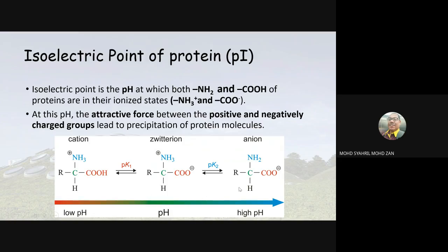Okay. So we put in high pH, alright. So kedua kita punya kumpulan amin dan juga kumpulan karboksil H dia akan hilang. Itulah prinsip di sebaliknya. Okay. So daripada acid, daripada clear kepada cloudy, cloudy kepada precipitate. Okay. So cation, clear, cloudy, precipitate, anion. Okay.